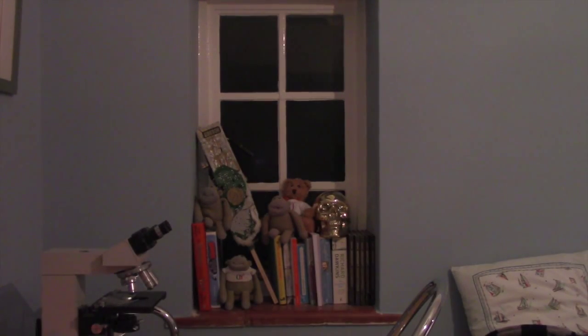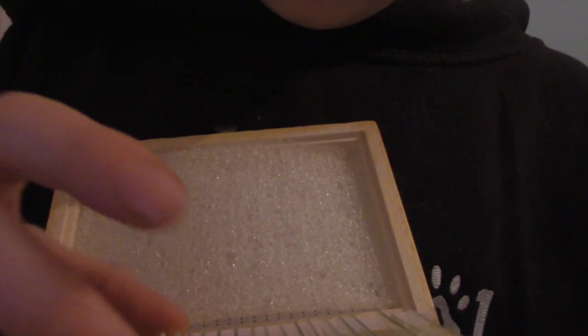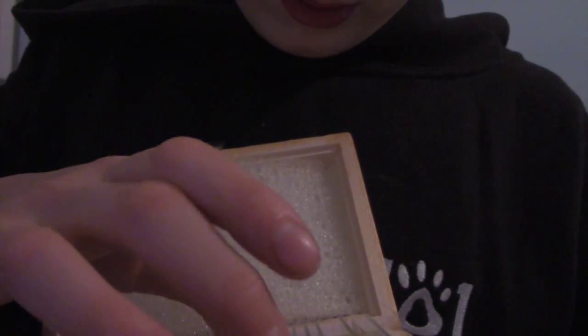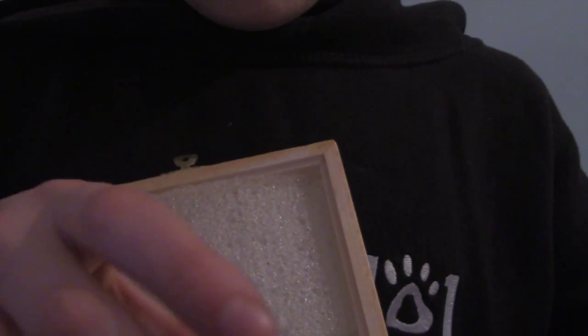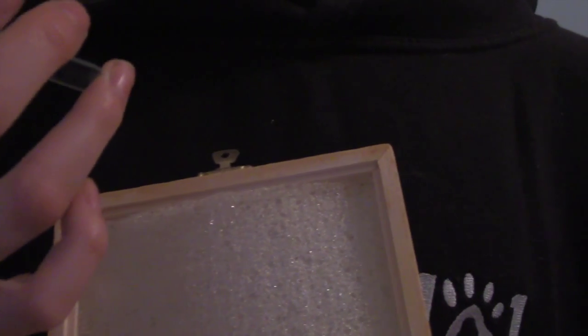I think we should have a quick look at a few of the pre-made slides from the box I mentioned earlier. Here's the box — quite a few in there. Let's do a random pick. I can't quite read the label — it's in small writing — but this one is cat lung cells, so let's have a look at that.